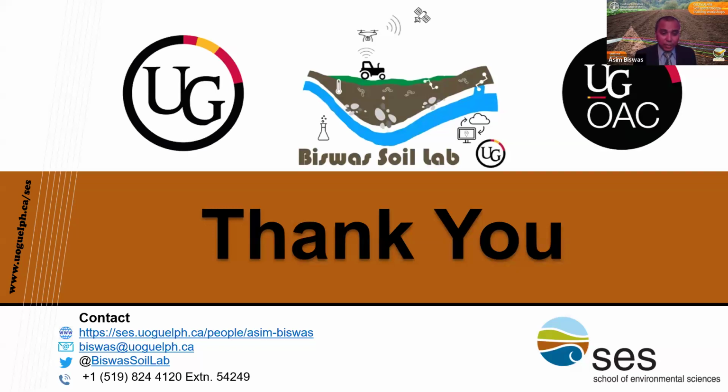But we have been thinking about creating some tools, some techniques or videos that could be actually utilized, whether we can host it in person, but of course, COVID taught us a lot of things. So we can do some online presentation, online training as well, particularly on data processing. It is difficult with the equipment, but you use it, you learn by doing it, that's easy. But some of the data processing and other things, which I have shown a lot of work on the data processing side, once you collect the data using a spectrometer, how you process, how you extract information.